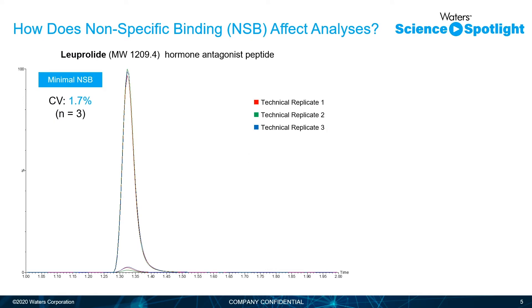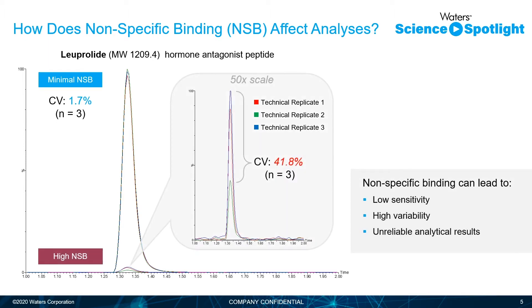So how does nonspecific binding affect our analysis? Here we're looking at a chromatogram of leuprolide, which has a molecular weight of about 1,200. In this circumstance, we have very little nonspecific binding — our percent CV is 1.7% with an n of 3, so our reproducibility is quite good. But if we were to take that same sample and not control for nonspecific binding losses, we get a very high CV of 42%. So we have very low repeatability, and the result is low sensitivity, high variability, and ultimately unreliable analytical results.